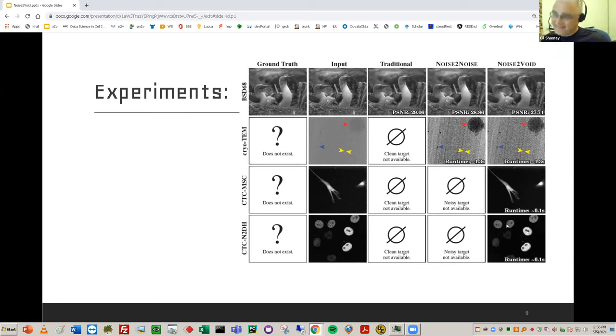You take an image, it's noisy, right? How would you get the ground truth? Yeah, that's right. So maybe you take an image and make it dirty, and create a simulated noise. That's one way: take an image and add extra noise to it, and then you can see how it improves going from the noisy image to the cleaner image. Probably that is what you have here in the first line. The first line is BSD68. It's a real image with a synthetic noise.